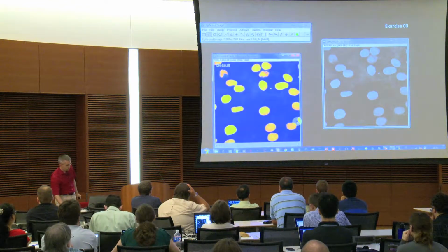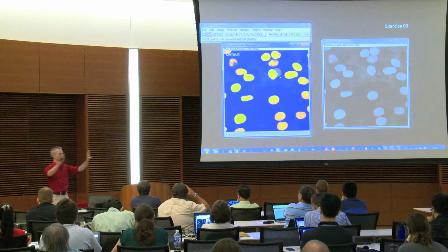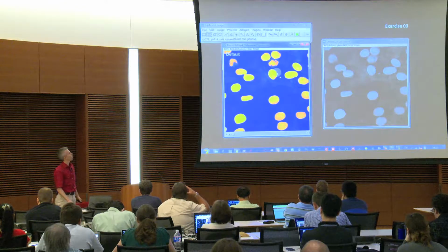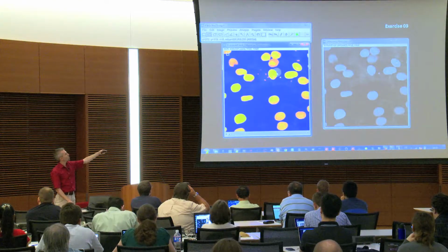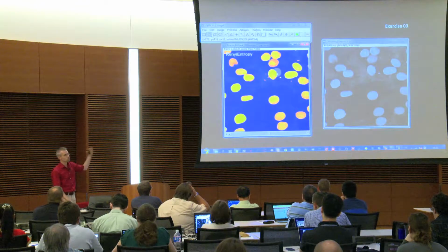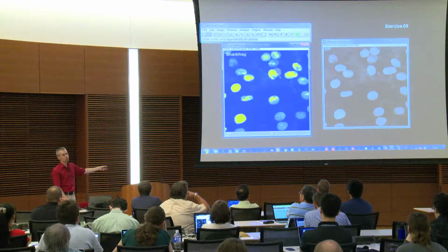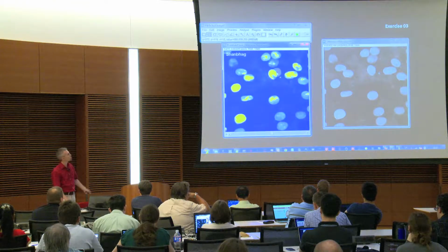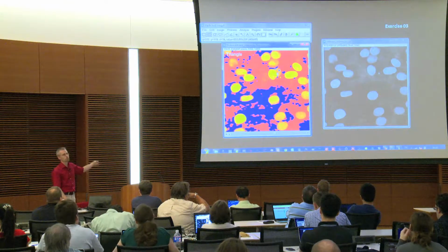If you do that, then you will get a stack. You could also have optionally chosen a montage where you see them next to each other. It's another possibility, that's up to you, how you can compare it better. You see the thresholding method mentioned up here, and then we can go through and have a look which might, based on visual perception, be the best extraction. So we see here that we would definitely lose much of the information because everything which is bright blue is lost. And this one would definitely be too much, so everything which is red is extracted, but we don't want to have it.